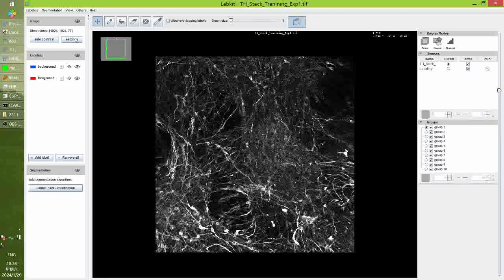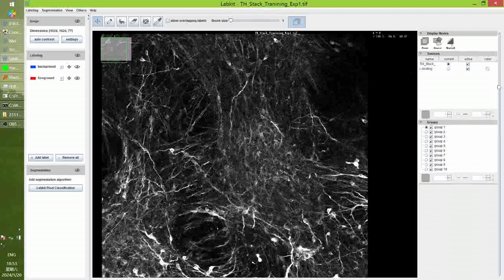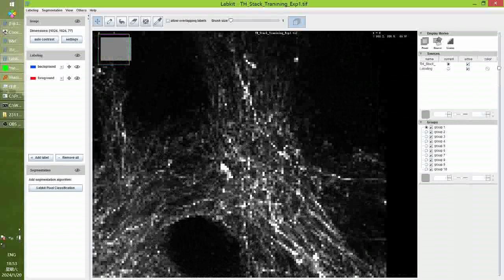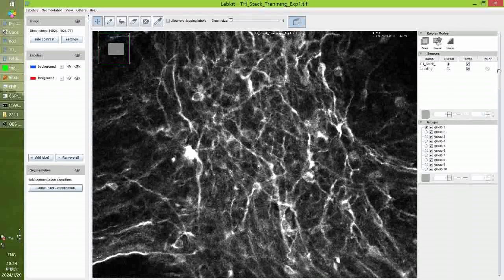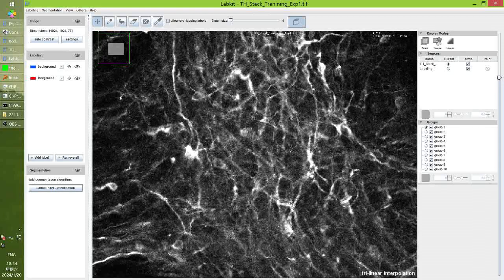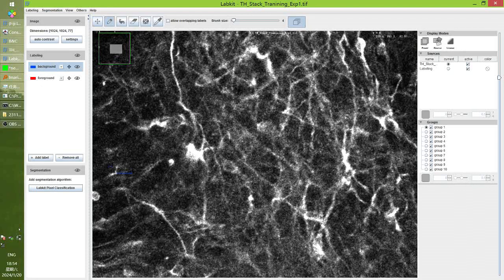The important thing is the smooth option. If we click this, it will be smoother, and this helps to draw on the image. But this will also bring another problem I will talk about later. If you use linear mode, use linear smooth. Okay, first let's draw background, pencil draw background and foreground.